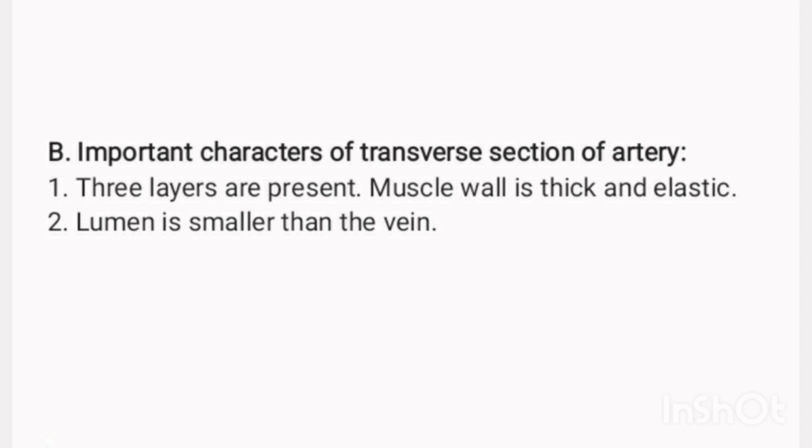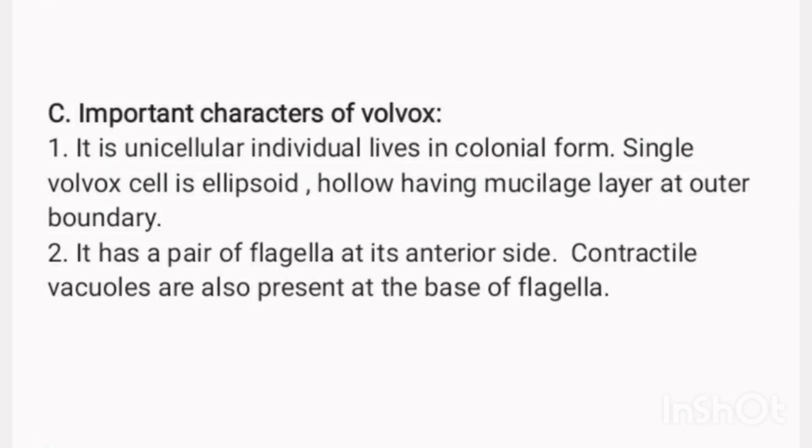B. Important characters of transverse section of artery. 1. 3 layers are present. Muscle wall is thick and elastic. 2. Lumen is smaller than the vein.